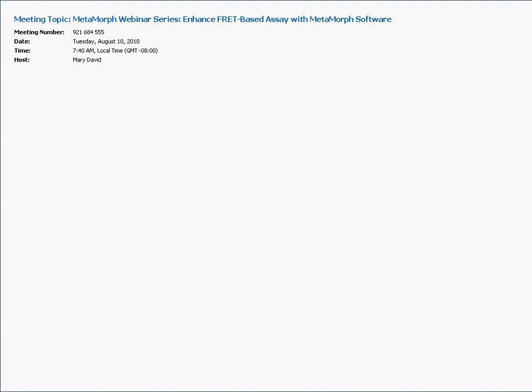So let me get back to my PowerPoint and show you that slide again. What we're correcting for is the direct excitation of the YFP fluorophore from the CFP excitation, and then how much of the CFP emission is bleeding through the YFP channel. So we need to correct for both of those to look at what our true FRET signal is.